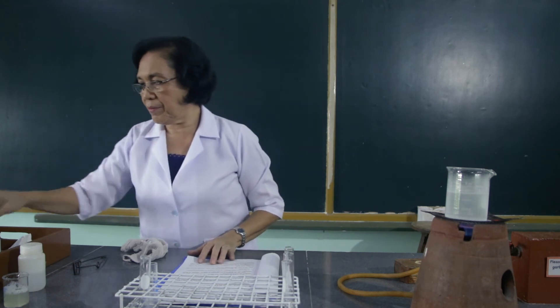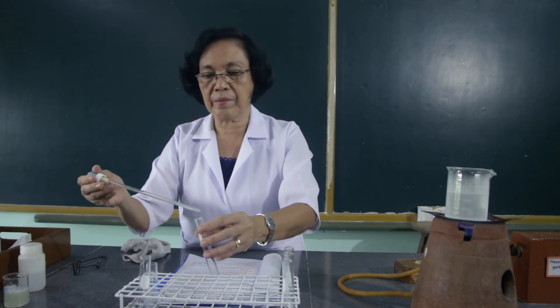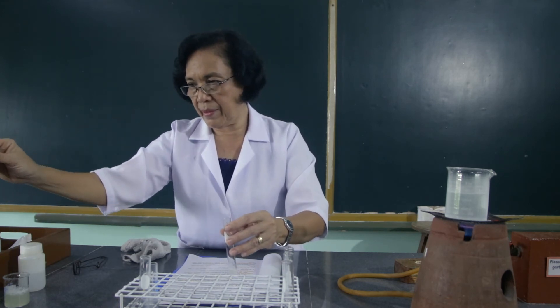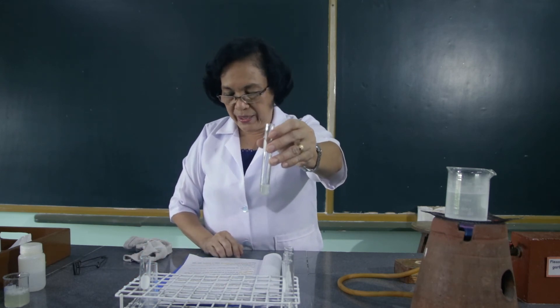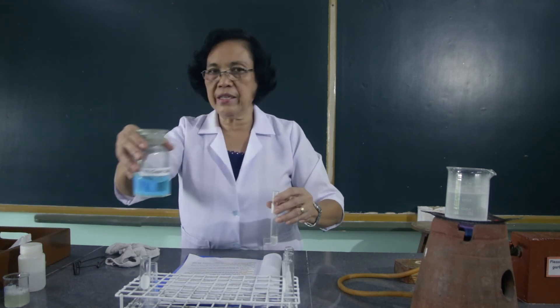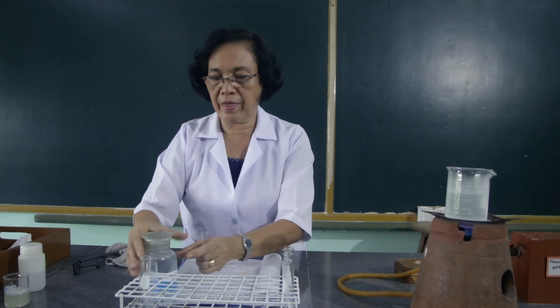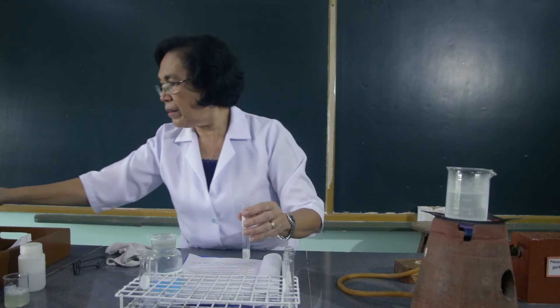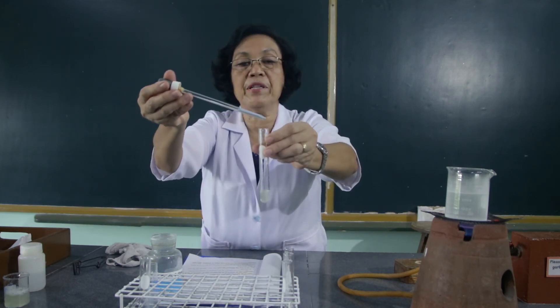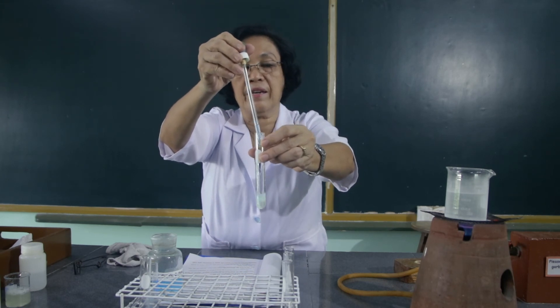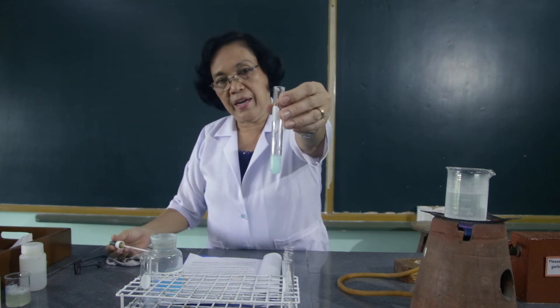The next precipitation reaction we are going to demonstrate is the precipitation of the egg albumin with the copper sulfate solution. We will use again 2 ml of the egg albumin. After this, we are going to add 1 ml of the cupric sulfate solution. I want you to observe what happens and whether a precipitate is formed.